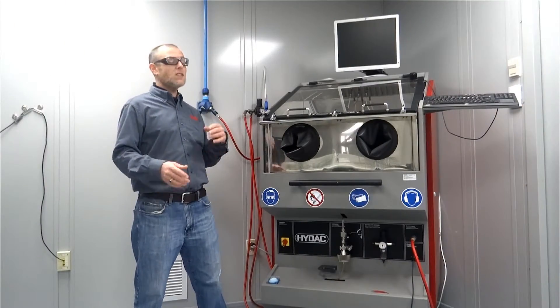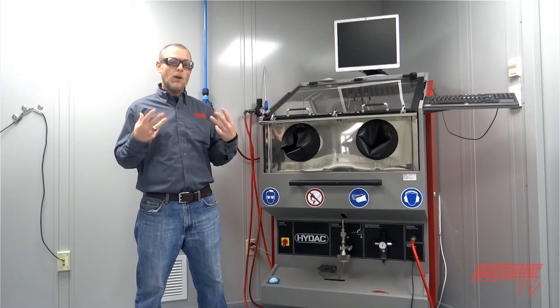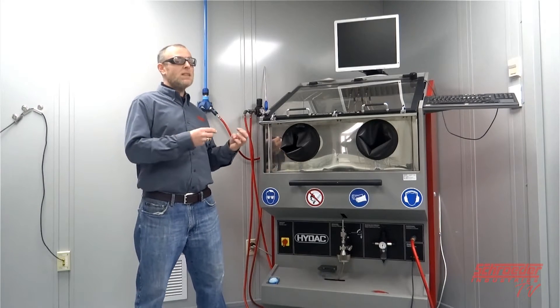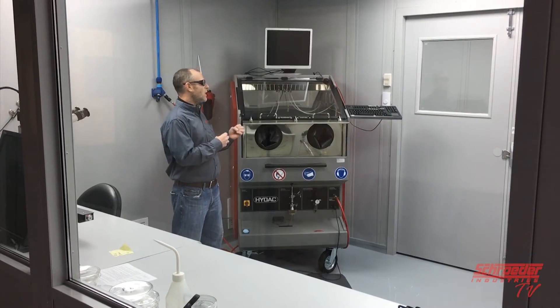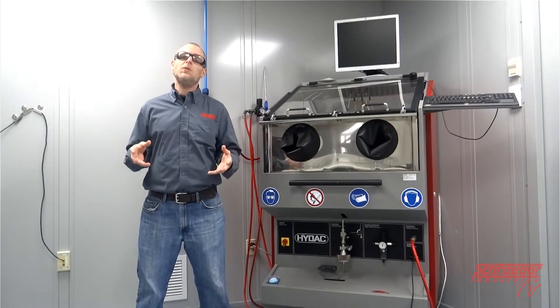Today at Schroeder TV we're going to talk about the contamination test unit. This unit is used to evaluate parts cleanliness and is not meant to be a parts washer. In this video we'll show detailed operation and procedures on how this unit is used.